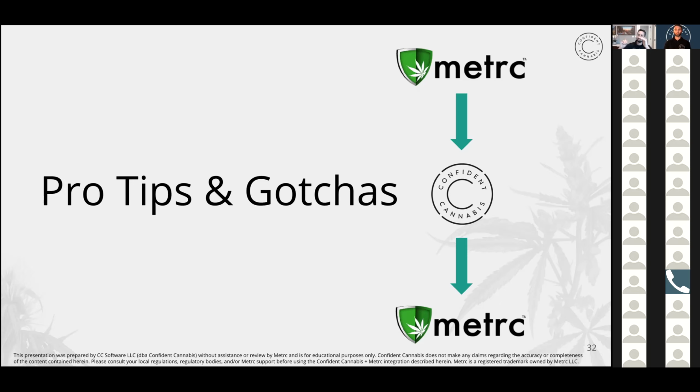And then that's what you can use to scan the barcode to create the sample in Confident Cannabis if you have like a mobile device or tablet there. If you don't, you're going to take the tag with you anyway. You can do that back at the lab if you want. But in your client's account, they have a batch and a child sample. That child sample is what you take with you, and that already has a tag on it.